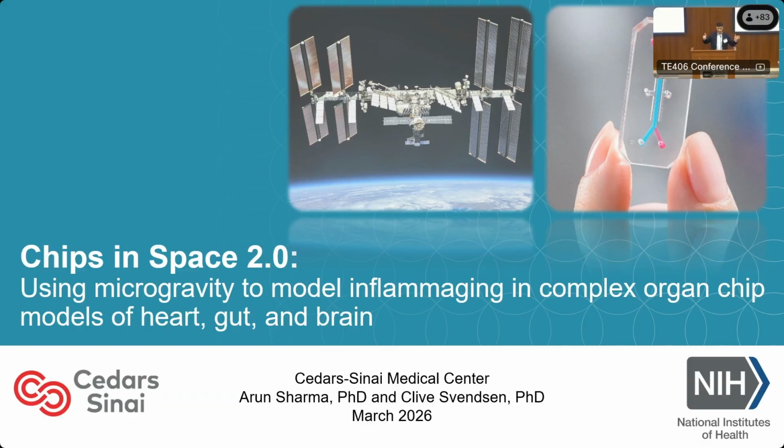Yeah, they're going to be separate systems. The multi-lineage part of it is going to be the integration of the macrophages. So that's how we develop that multi-lineage context. But what we're also hoping to do as part of the grant is to see if we can develop an all-in-one media that would be able to potentially connect these different chip systems if we need to. So a hybrid media component. So yeah, that's part of what we're working on.